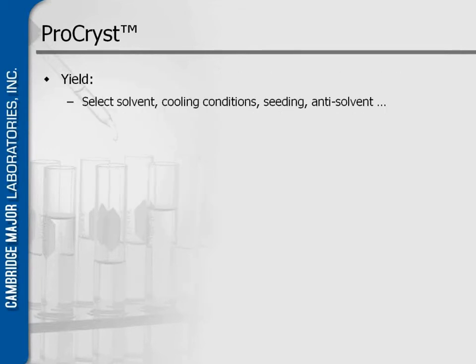I have 4 examples here on how to do it. You can have a look at the yield. So by looking at your metastable zone width, you can calculate how much will be present at high temperature, how much will be present at your low temperature, room temperature or anything, and the difference is how much yield you can get.